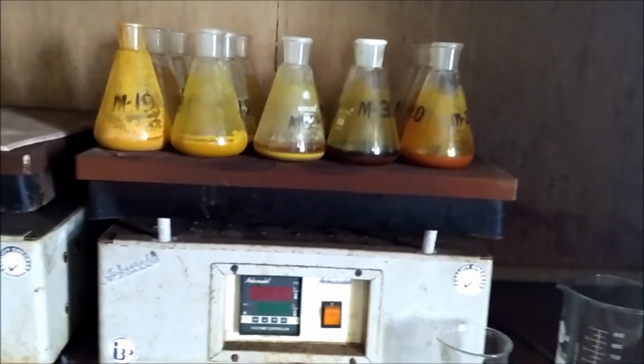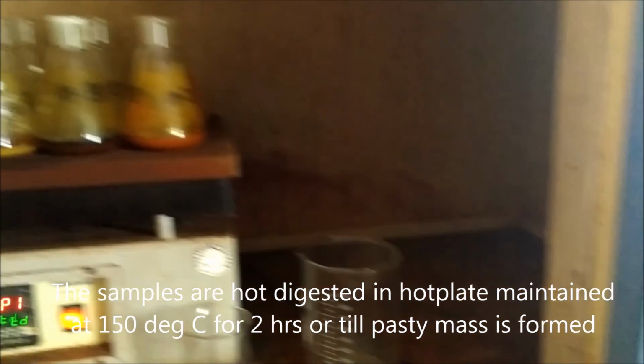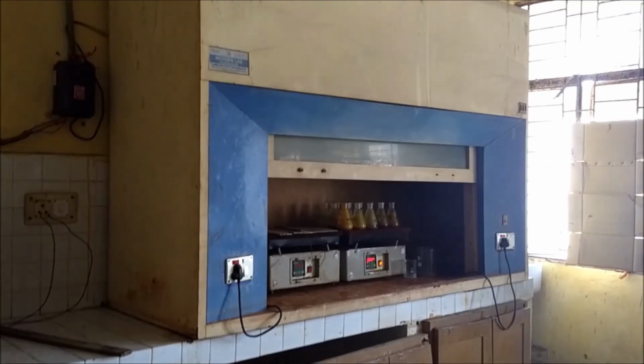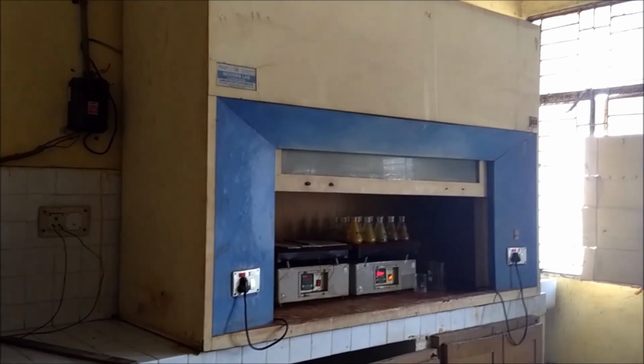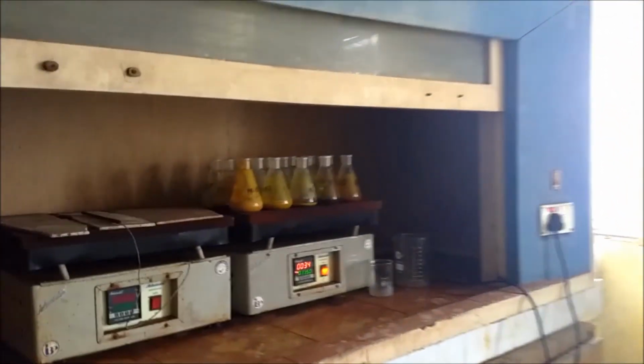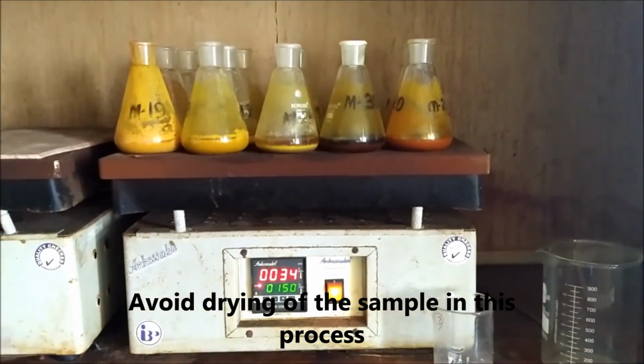The effectiveness of the acid increases at the optimum temperature of 150 degrees Celsius. While heating, we have to take care of the sample so that drying does not happen, else we have to repeat the whole process again.